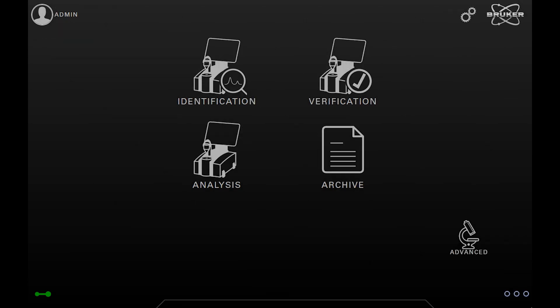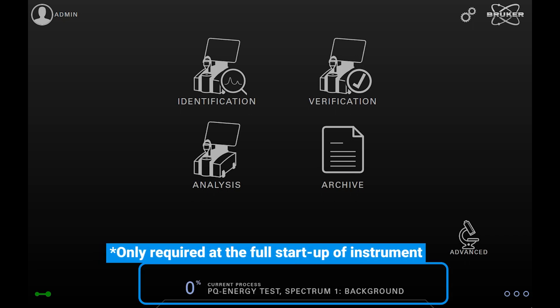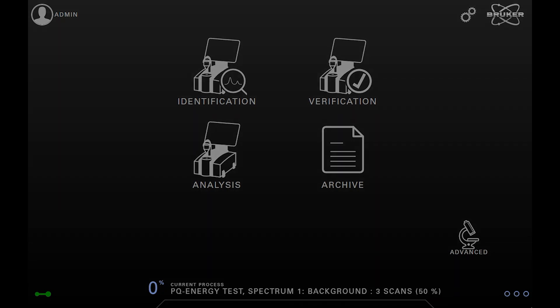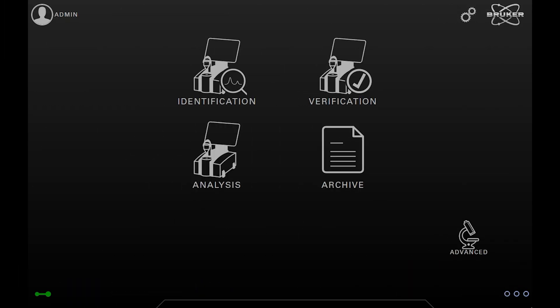The default home screen is selected during the instrument's setup. We now wait until the automated self-test has been completed. Okay, now we are done. The first topic of interest at the beginning is often how to get help.